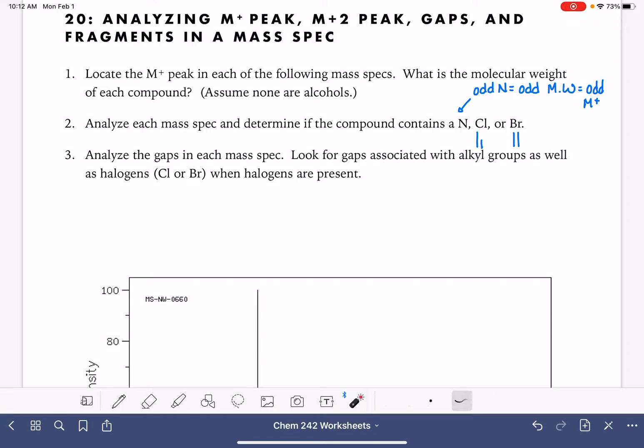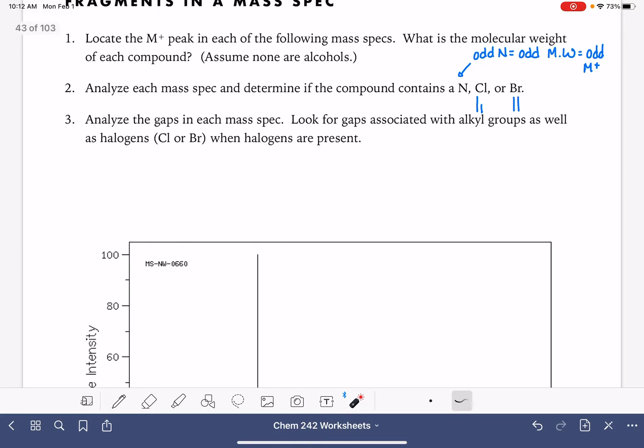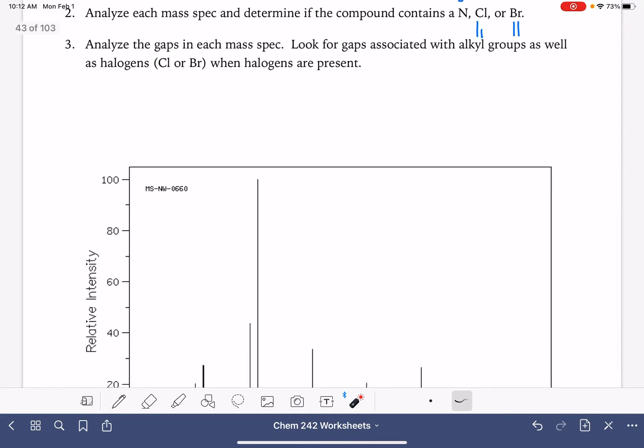And then we're also going to do some gap analysis. We're going to look at the gaps in the peaks in the mass spec and see if we can get some information about what they tell us.